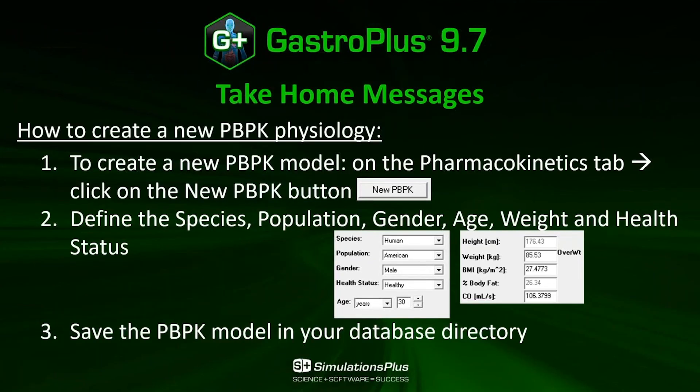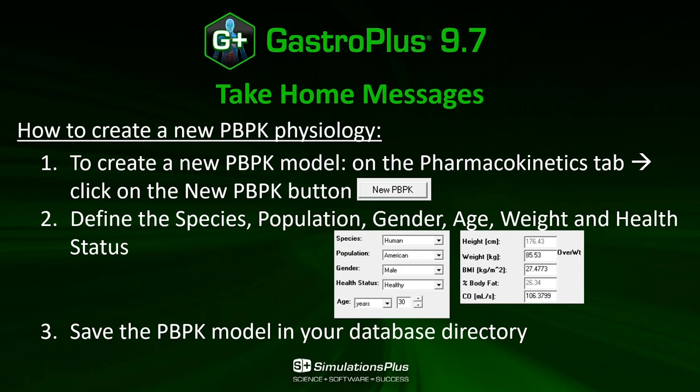So the take-home message of this video: to create a new PBPK model, you go on the Pharmacokinetics tab and you click on the new PBPK button. Then you need to define the species, the population, gender, age, weight and the health status of your individual. And finally, you can save the PBPK model in your database directory.